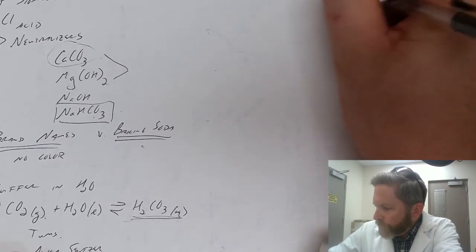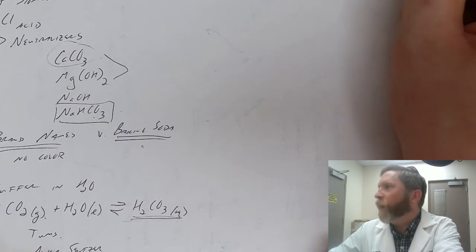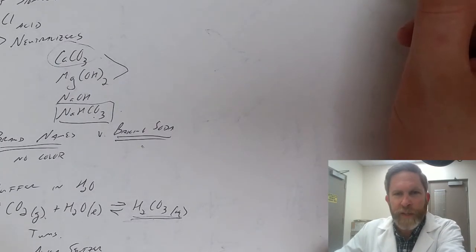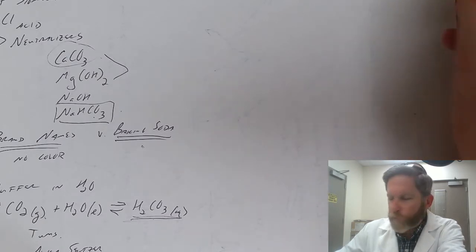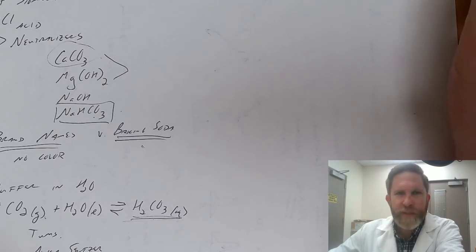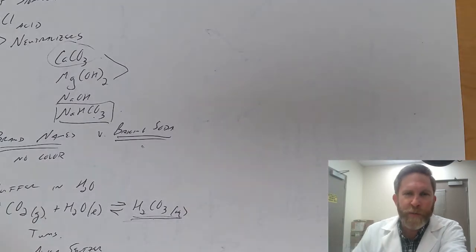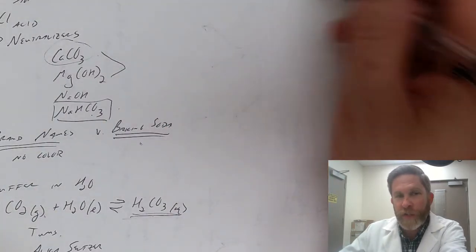And you'll need at least 2 samples of each. One of the reasons for this is, as we've discussed in previous labs, that we want to talk about our precision and lab technique. And so we want to make sure that we do things in replicate in case we come up with what's known as an outlier. You may have to do a third one, but you're going to do at least 2 times. The third one would be necessary if they're not consistent, if they're not close, because there are many things that can contribute to this, but you won't know necessarily unless your starting weights are exactly the same, how close they are, until you do your math.